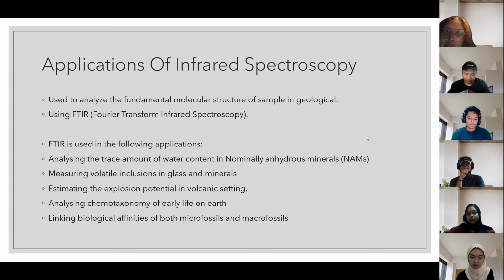Not only that, to estimate the explosion potential in volcanic settings, analyze chemotaxonomy of early life on Earth, and also to link biological affinities of both macrofossil and microfossil. So next slide.